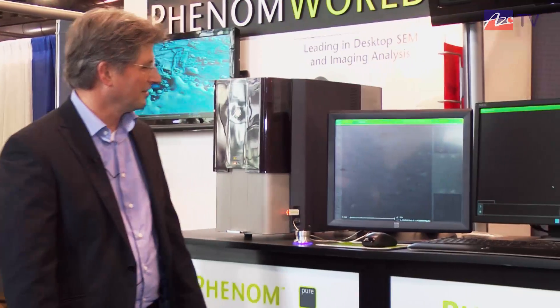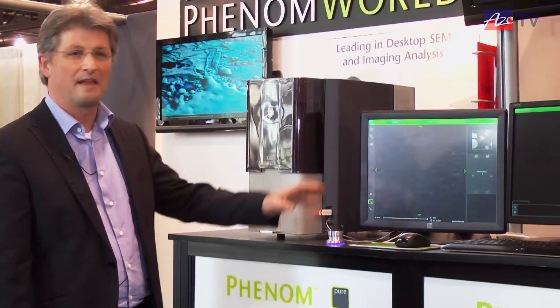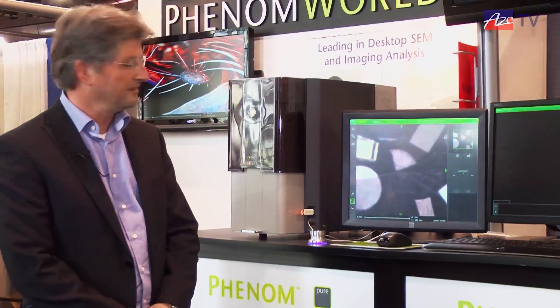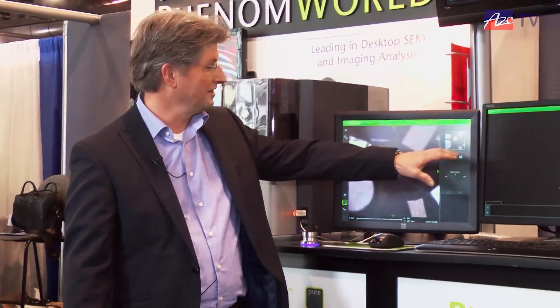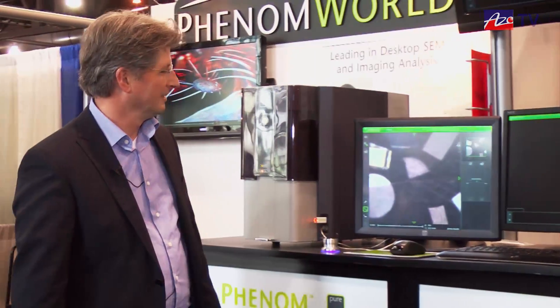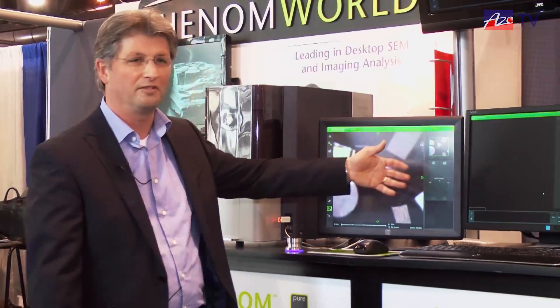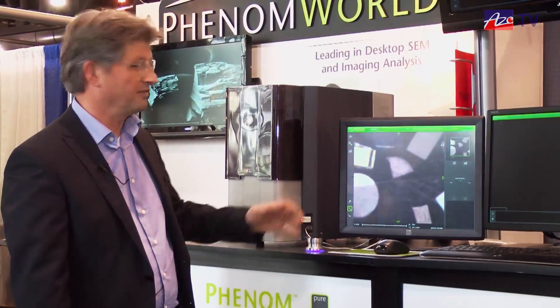You can see it starts working. We immediately get a first image made by a digital camera, and we call this our never-lost system. So you always know where you are on your specimen. You see immediately if there's anything useful on the specimen or not, and if not you can take it out and put in your next sample.